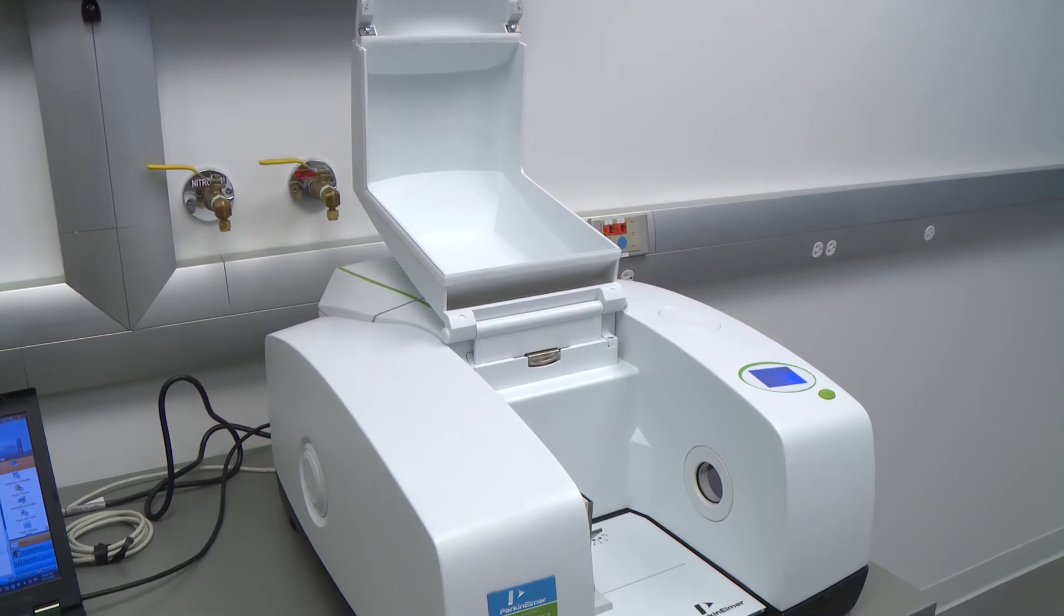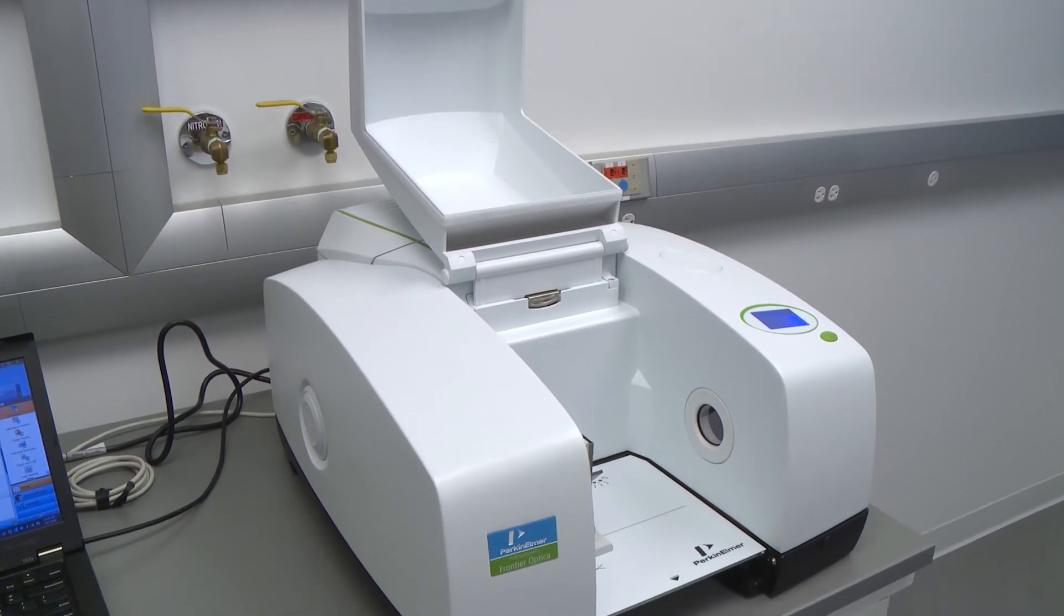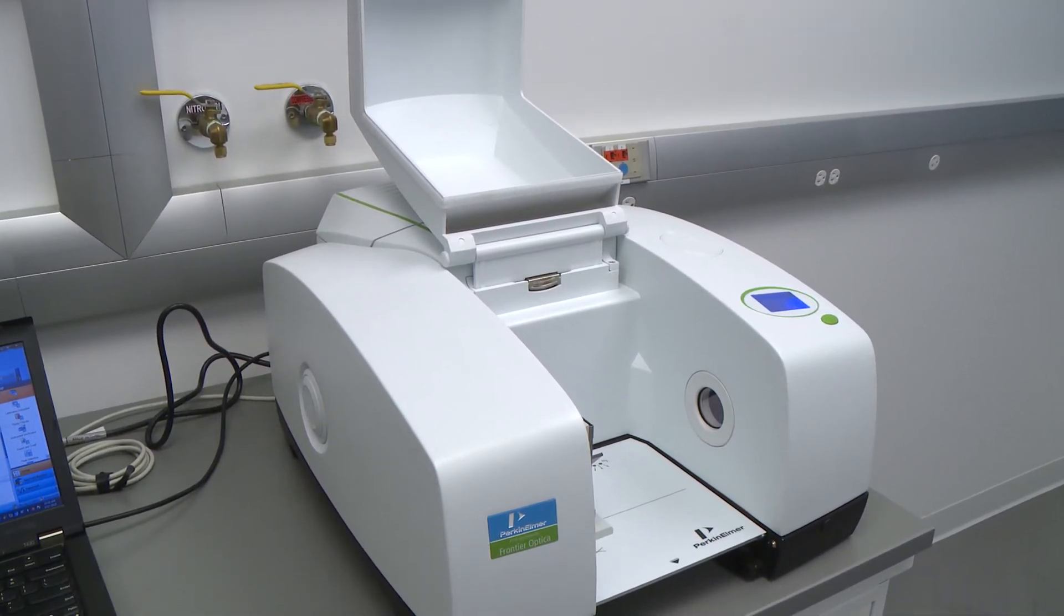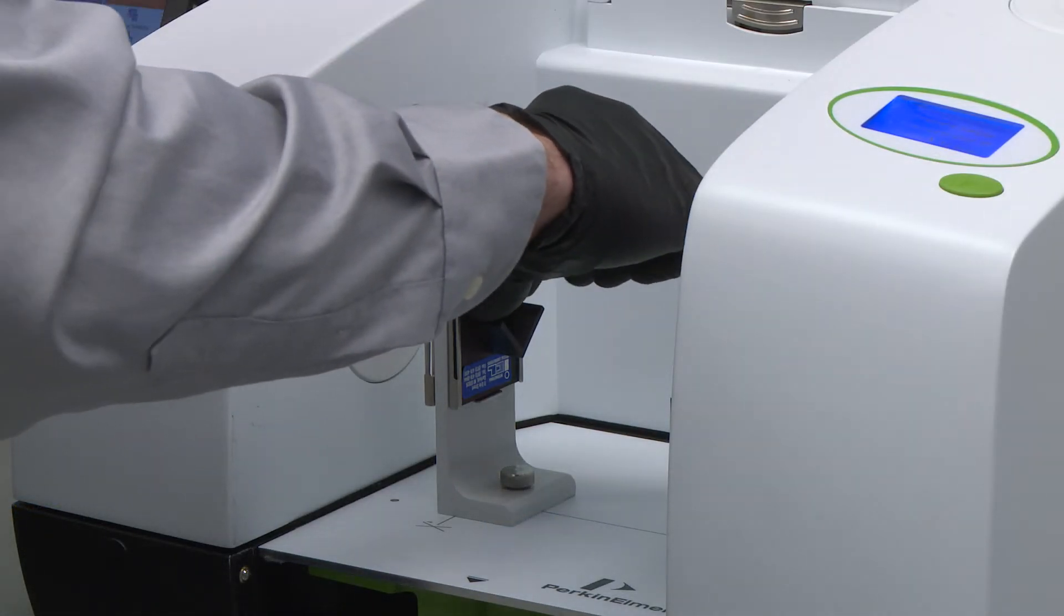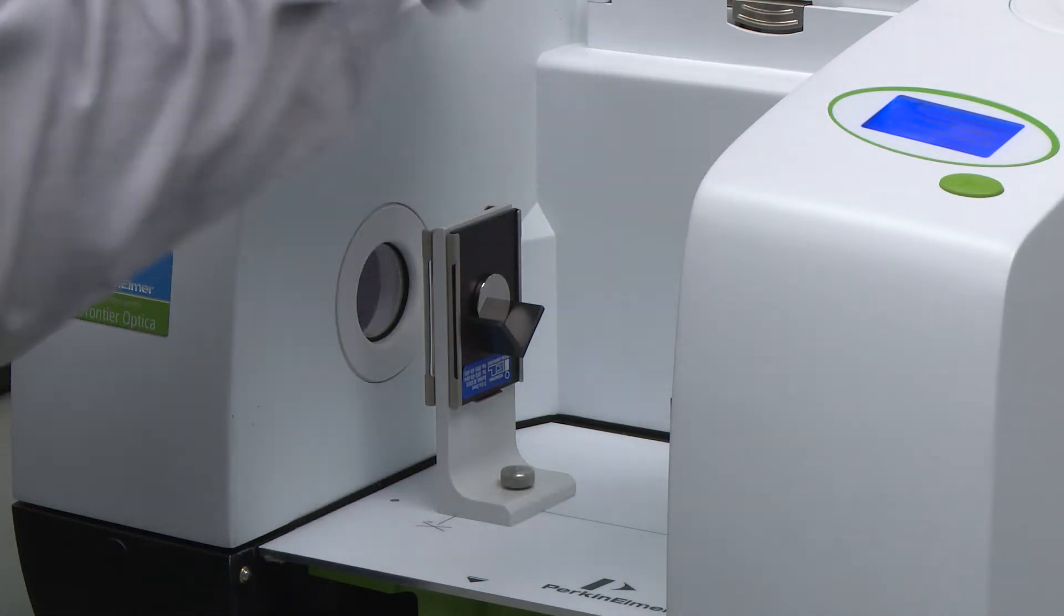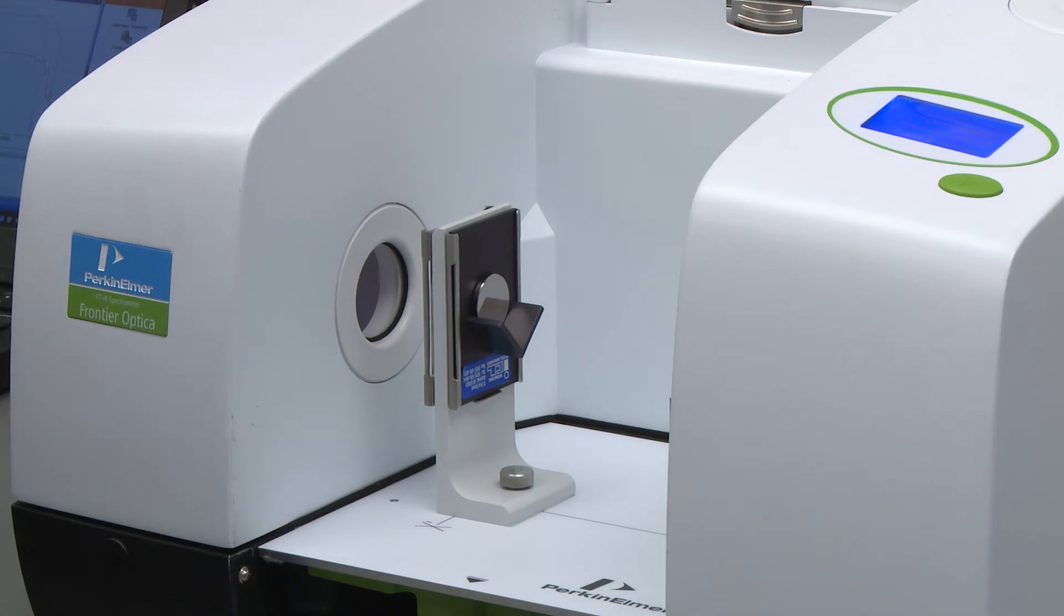During the background measurement, the sample compartment is left open without a sample in place. During sample measurement, the sample is placed in a holder. This allows the infrared light to pass through the sample for the sake of measurement.